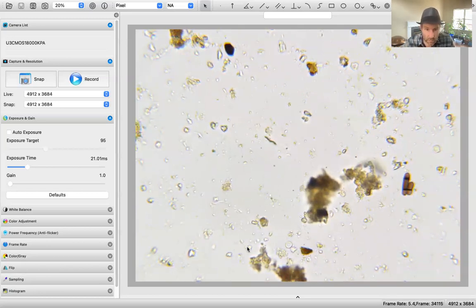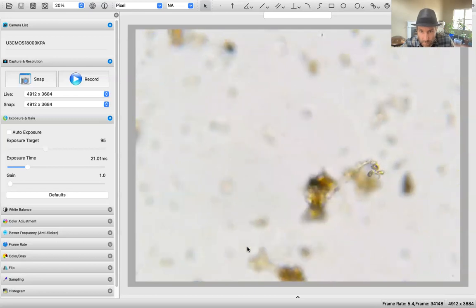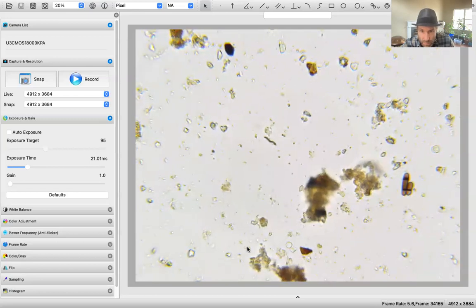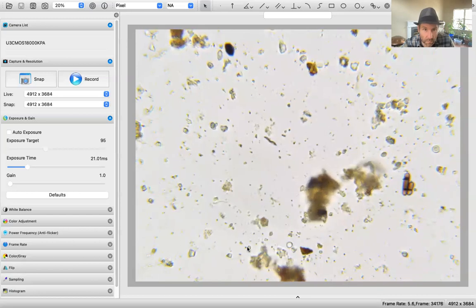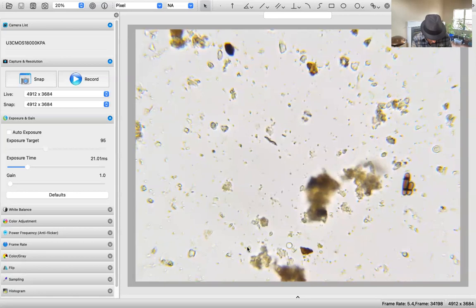I don't see anything to count. All the way to the top, just to make sure, all the way to the bottom. No protozoa, no flagellates. That's an NA.